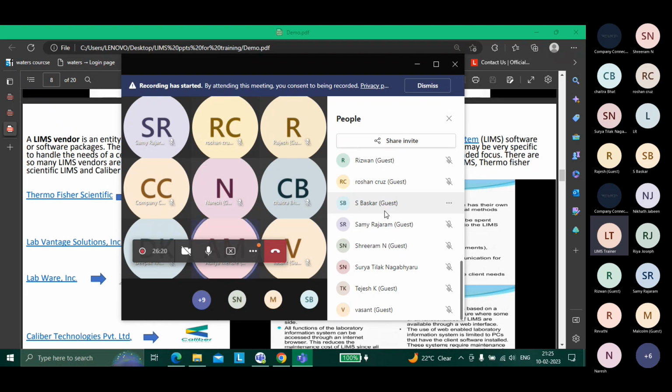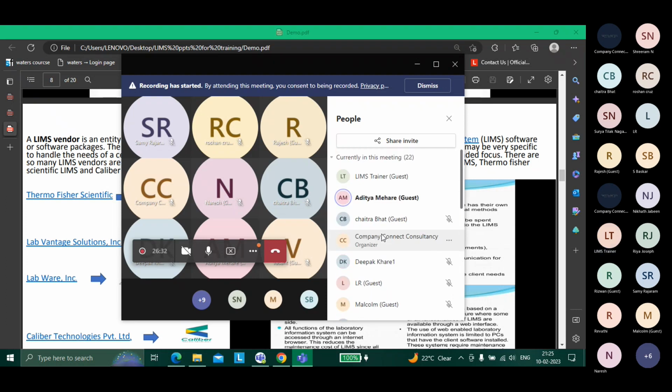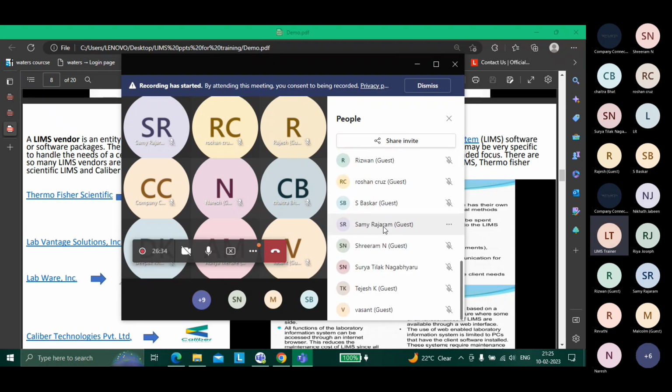Of course, there will be 9. Like we have Windows 11, maybe it will be 12, who knows, 13, 14. Like we have Android 10, Android 11, this will go on, right? But try to understand one thing. This is what I try to tell everyone. I need to know what is in version 8, what is in version 9, but some basics will never change.